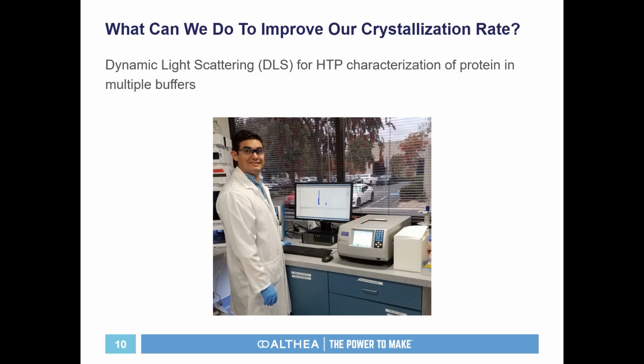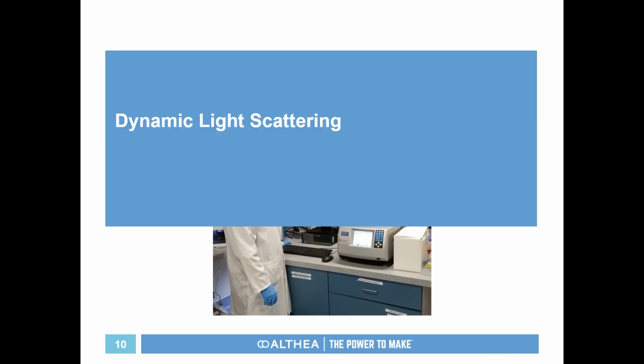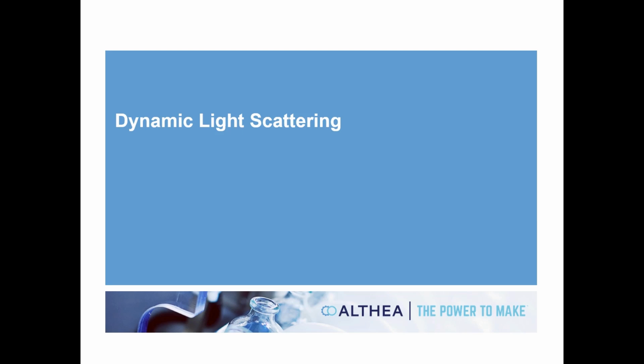So what can we do to improve our crystallization rate? Well, we've turned to dynamic light scattering with a high throughput characterization of the protein in multiple buffers to dramatically improve our timeline. I'm going to take a step back now and talk about dynamic light scattering.